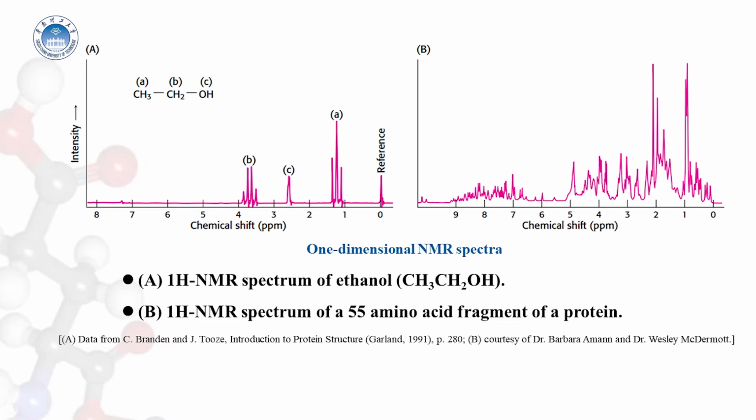The different frequencies, termed chemical shifts, are expressed in fractional units delta, parts per million, or ppm, relative to the shifts of a standard compound, such as a water-soluble derivative of tetramethylsilane, that is added to the sample.